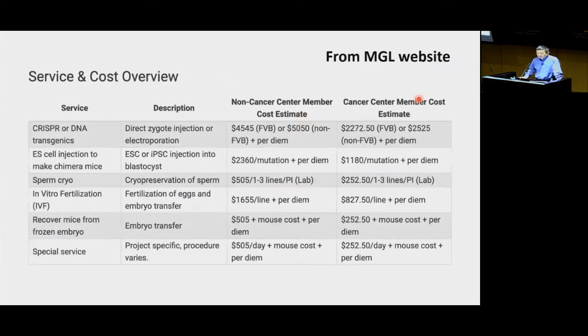When we're looking at the project we have, even smaller template, smaller knock-in or large knock-in, say 9 kb, whatever. Usually there's a cut from mice when we ask the lab to give us data. From that, I depend on the lab. The lab has to give me data so I can talk. Otherwise, I cannot say anything. So far, we see that it always has a cut. So you have an indel, small deletion mice there. Basically, it's knockout mice.